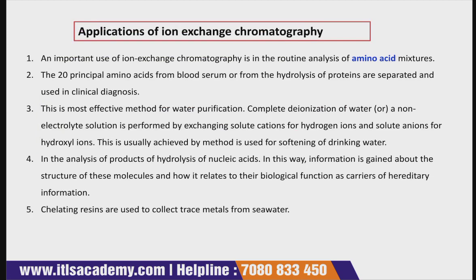Now comes the application of ion exchange chromatography. The first application, an important use of ion exchange chromatography, is routine analysis of amino acid mixtures.